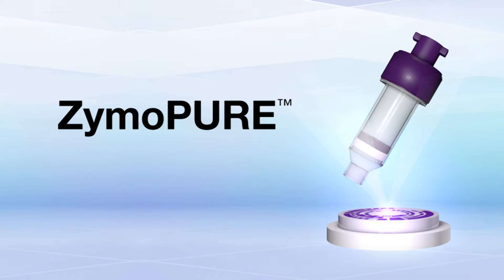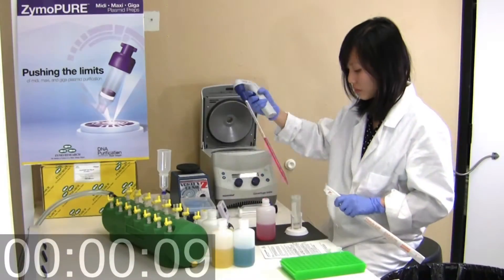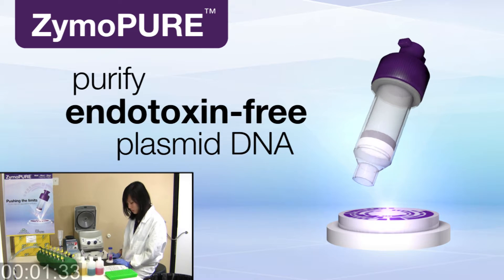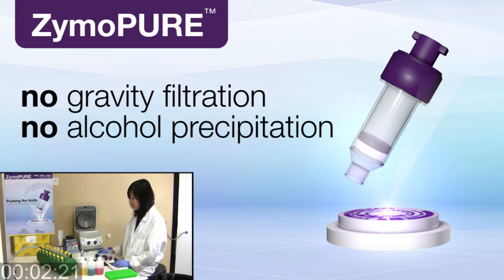Introducing ZymoPure, an innovative and high-quality plasmid DNA isolation technology. Watch as one of our scientists isolates plasmid DNA in less than 18 minutes. With ZymoPure, purify endotoxin-free plasmid DNA without the need for gravity filtration or alcohol precipitation.